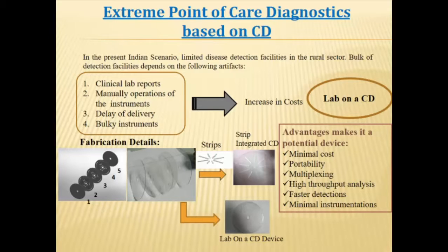This CD will have 3 to 5 layers. Microfluidic channels you can make in one of the CD layers, and there will be 2 layers to combine this 5-layer CD, to attach it, to bond it.